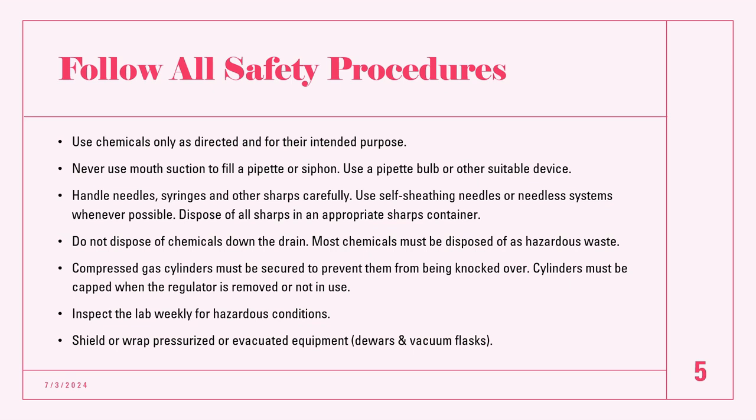Do not dispose of chemicals down the drain because most of the chemicals must be disposed of as hazardous waste. Compressed gas cylinders must be secured to prevent them from being knocked over, and cylinder must always be capped when the regulator is removed or not in use. Always inspect the lab weekly for any hazardous condition that might be present. Shield or wrap pressurized or evacuated equipment.